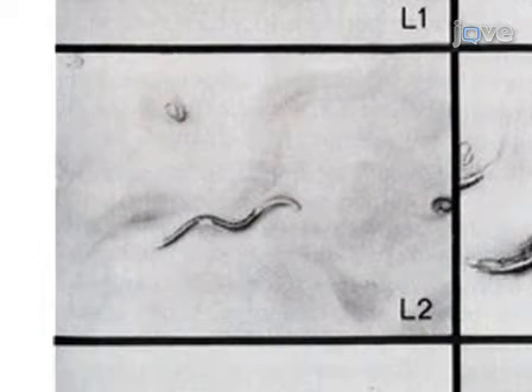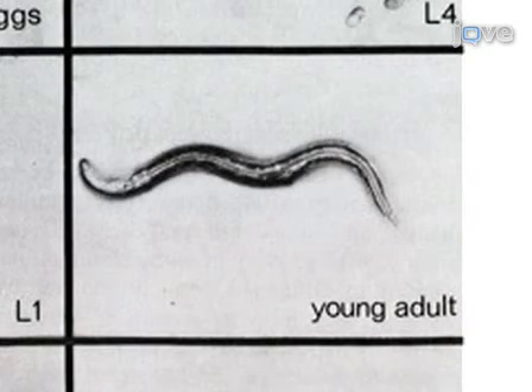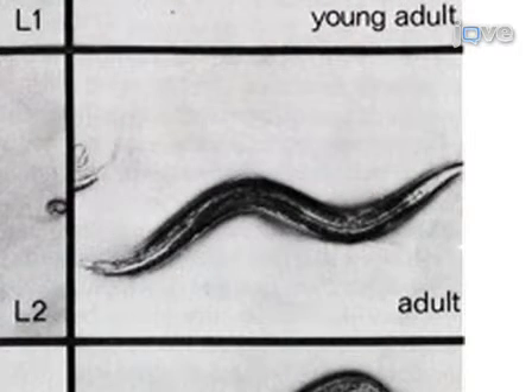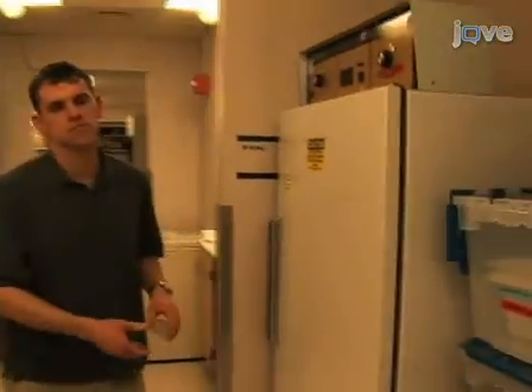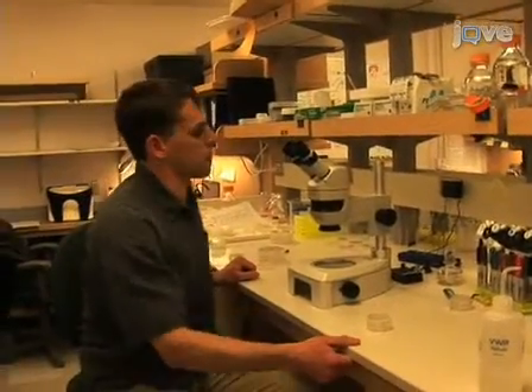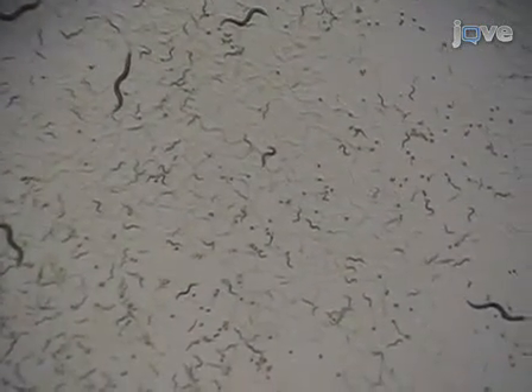This section describes how to follow the life of an age-synchronized population. First, transfer the L4 larvae from the TEL plate to seeded AMP-FUDR plates. For each strain or condition being tested, it is typical to set up 2 to 3 plates with 25 to 30 worms per plate. Incubate the AMP-FUDR plates at 20 degrees Celsius for 24 hours, and then visually assess the worms, media, and bacteria. Transfer worms to fresh AMP-FUDR plates if the worms have eaten most of the bacterial food. This will typically occur once or twice a week early in the experiment.